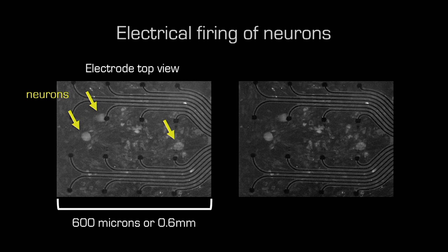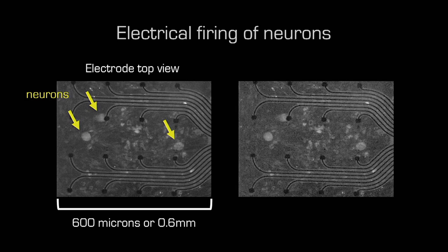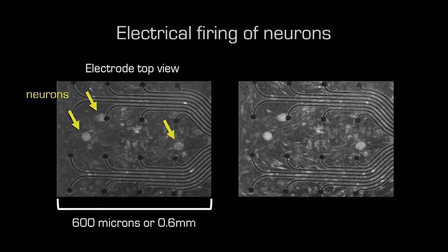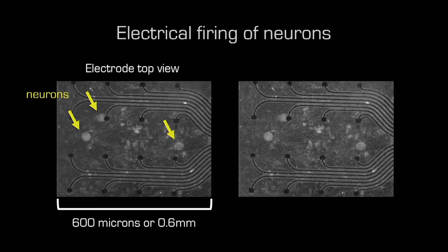Now, these are support cells that are needed for your neurons to function in your peripheral nervous system. And I'm going to show you a quick video. So this is an example of us flowing in a chemical. We're stimulating those receptors on the cells, and you can see everyone lights up. So then we can use imaging on our microscope to see which cells are responding, and we can actually quantitate how much they're responding to each chemical using this technology.